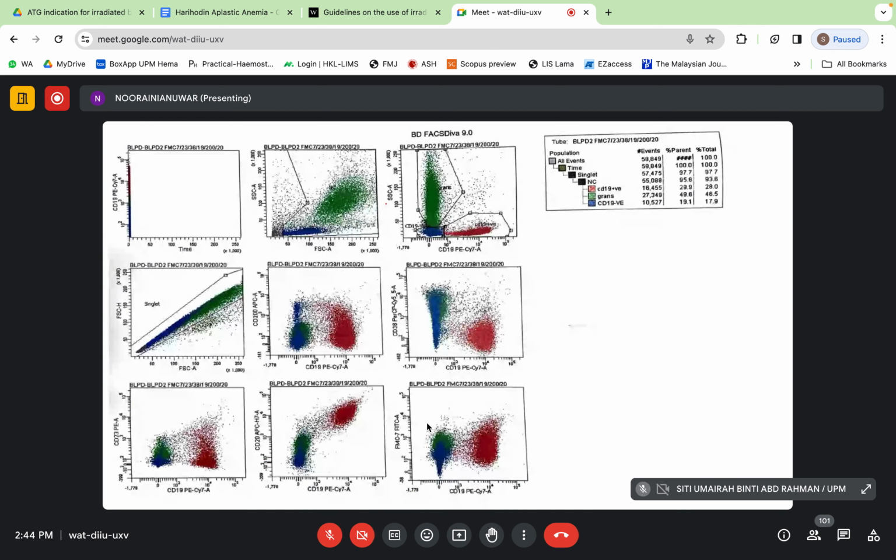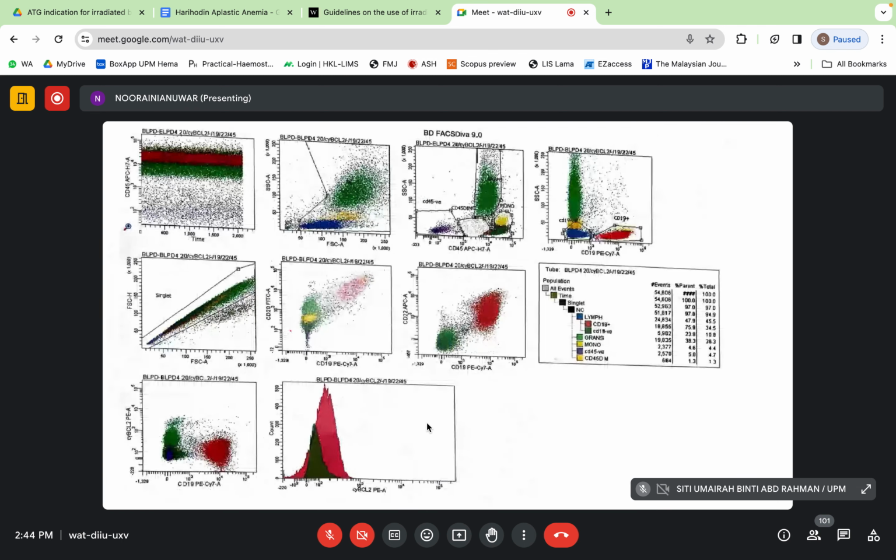Okay, and then the next BLPD shows that our POI is negative for CD200, negative for CD38, and negative for CD23, as well as FMC7 also negative. So essentially it's CD19, 20 positive for B markers, and then CD5 positive and negative for 23, 200, FMC7, and 38.